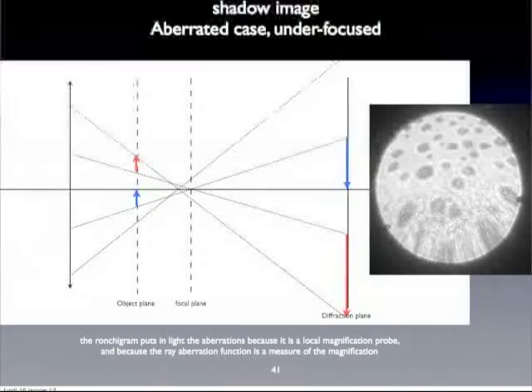So now assume you have some aberration. Again, we'll see tomorrow exactly how it works. But the point is that, as we saw, at small angle you have one focal plane, and at high angle you have another one. Okay, so for these two rays, you have two different focal points.